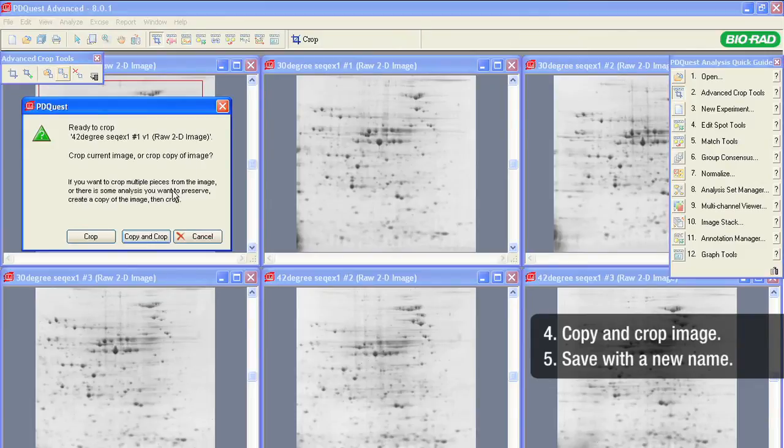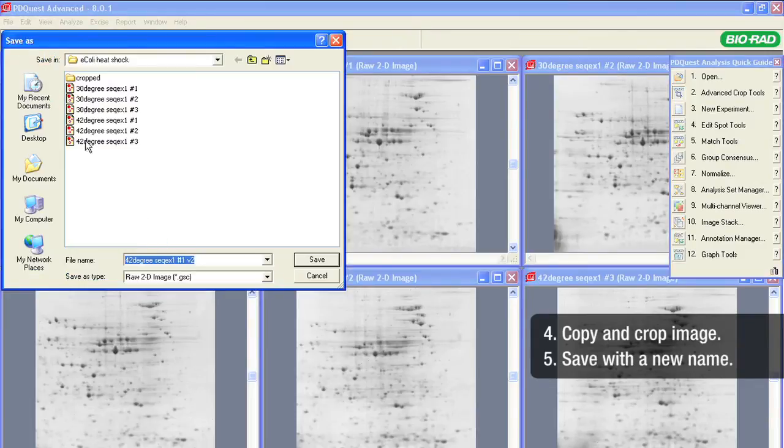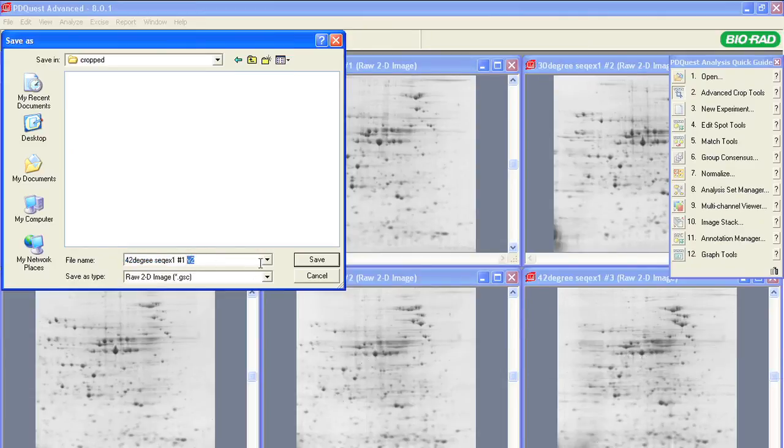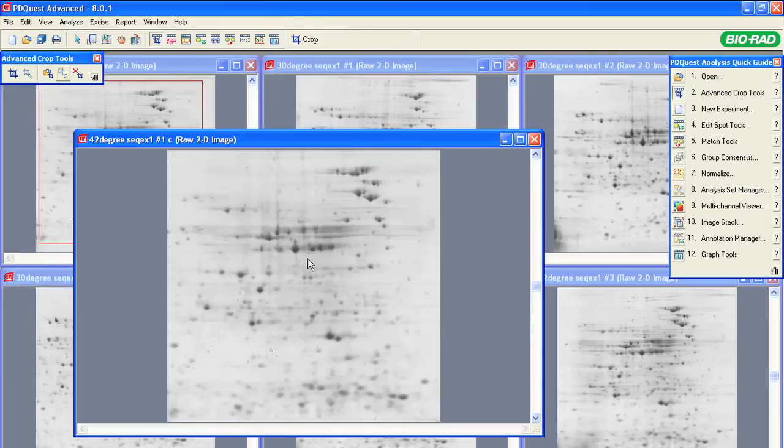Left-click, select the Copy and Crop option, and save the cropped image with a new name. This will preserve the original image file. We don't advise using the Crop option because it will overwrite the original file.